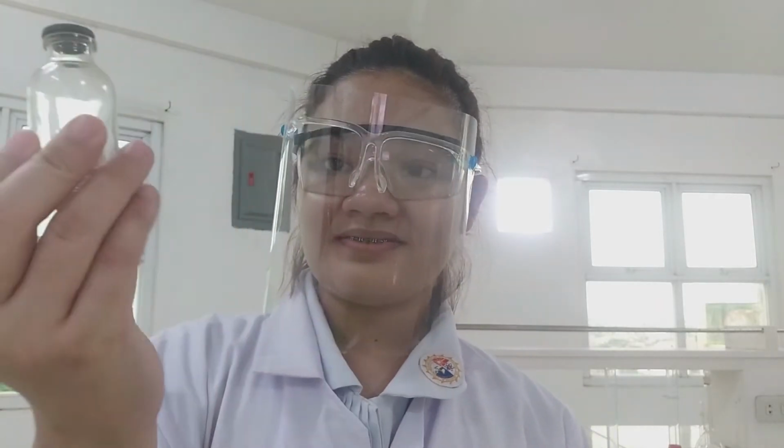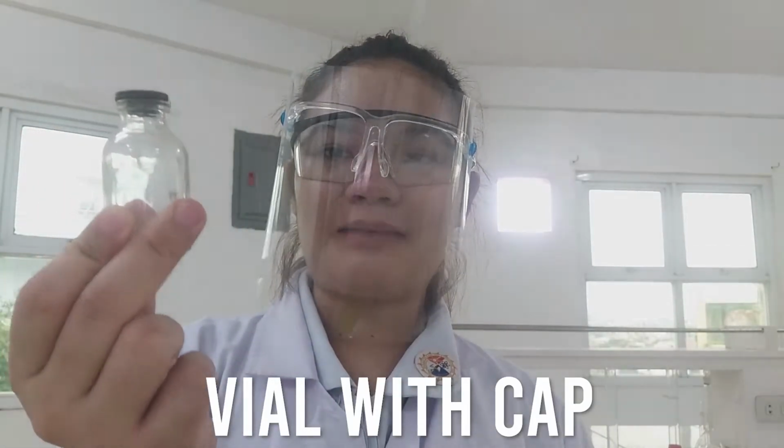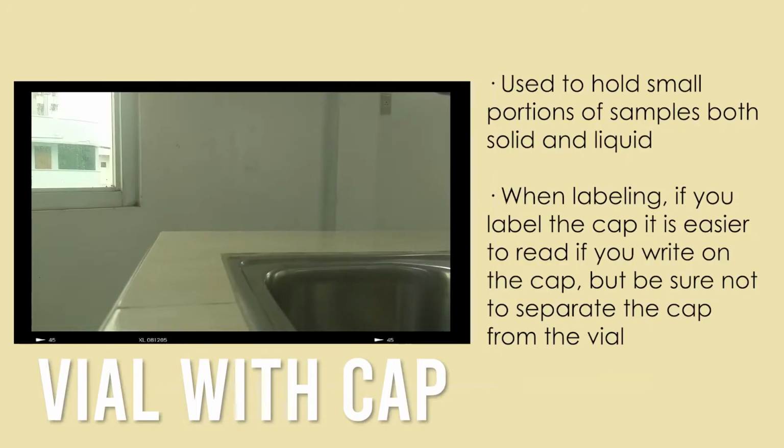Last in this category is the vial with cap. This one is used to hold small samples, both solid and liquid.